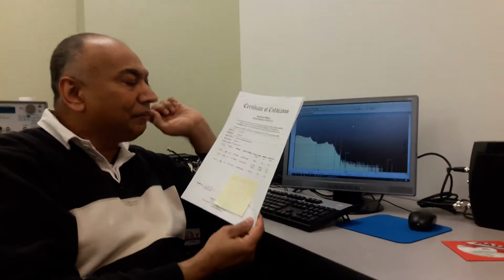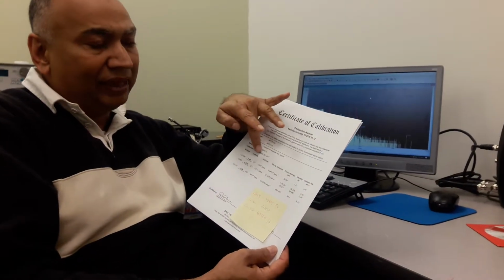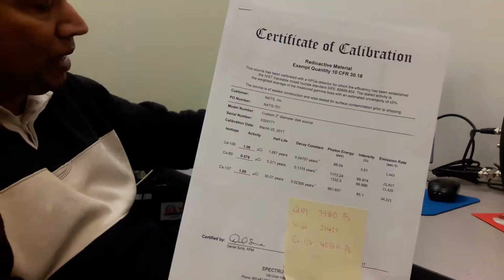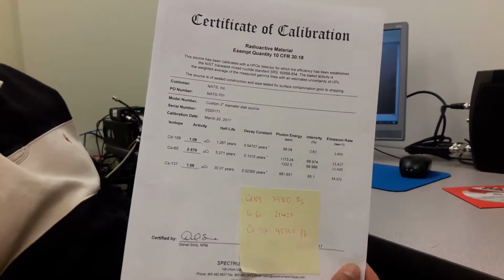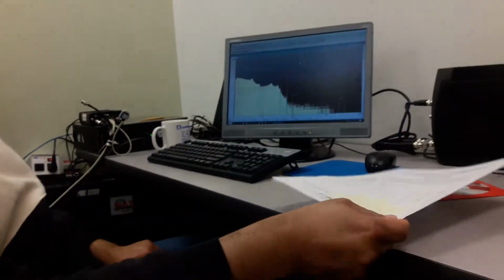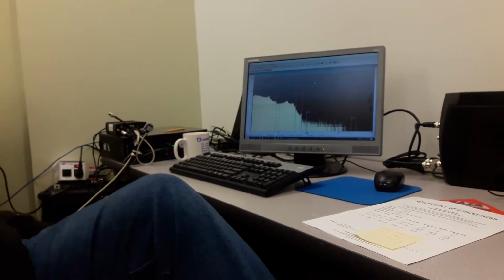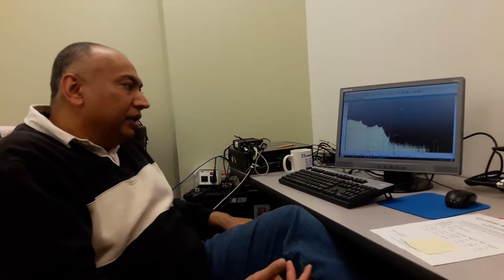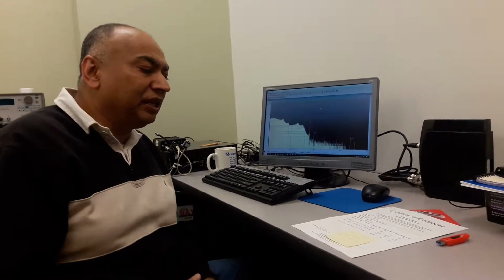So for this, there is something very important I like to mention, which is that the date format in the calibration certificate has to match the date format of the computer date and time format. And I say this with particular emphasis for those of us in the United States. Our date format is completely different from the rest of the world. In the United States, we usually go by the month first, then the date, and then the year. In most of the rest of the world, it is usually going to be the day first, month and year.